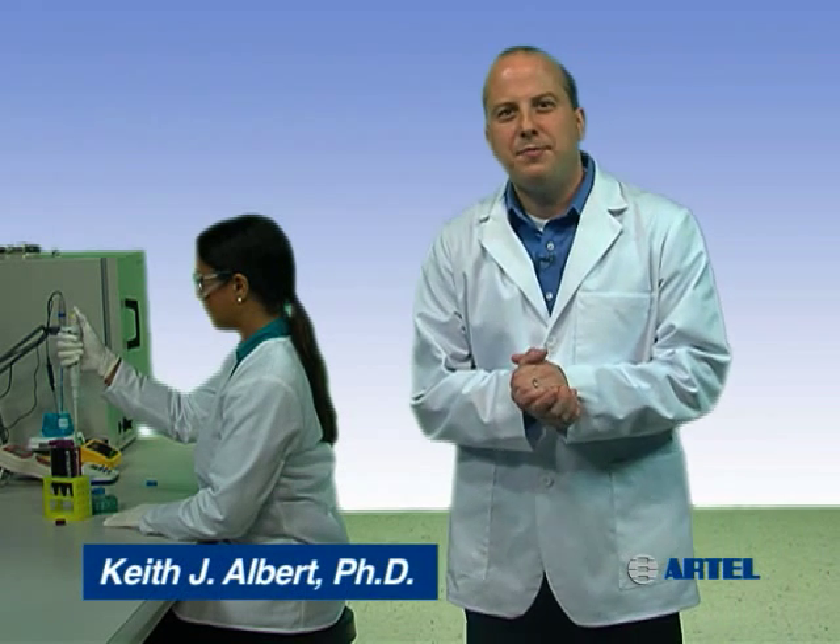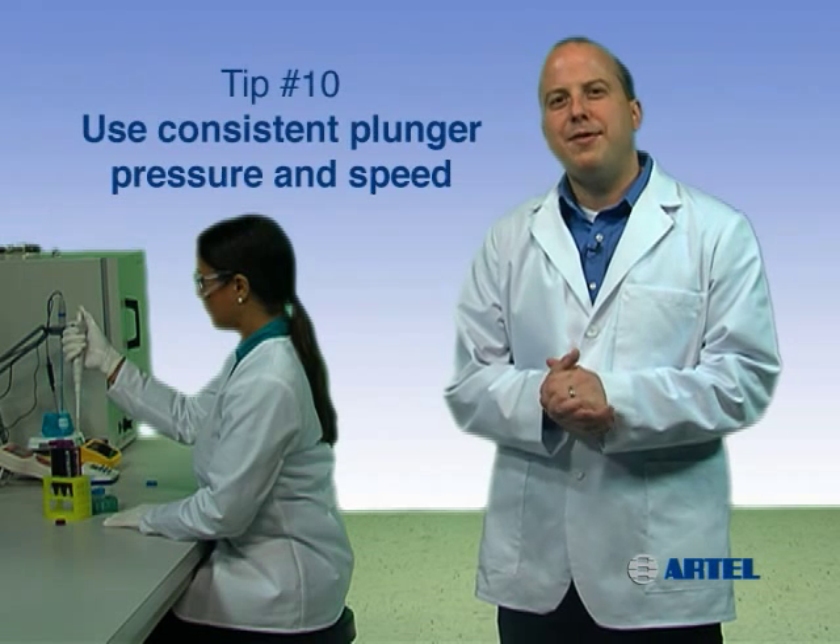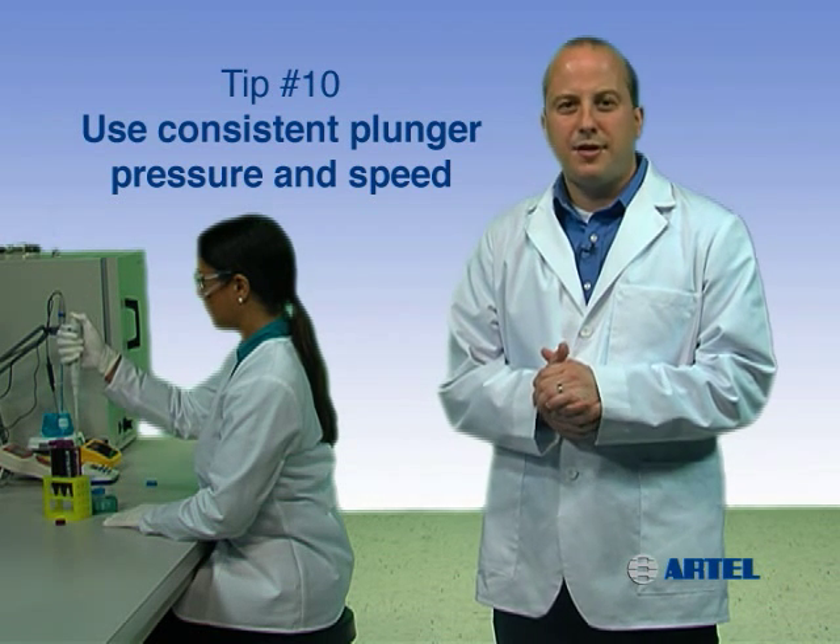Using proper pipetting technique helps you build confidence in your work so you can trust your results. Pipetting tip number 10: use consistent plunger speed and pressure.